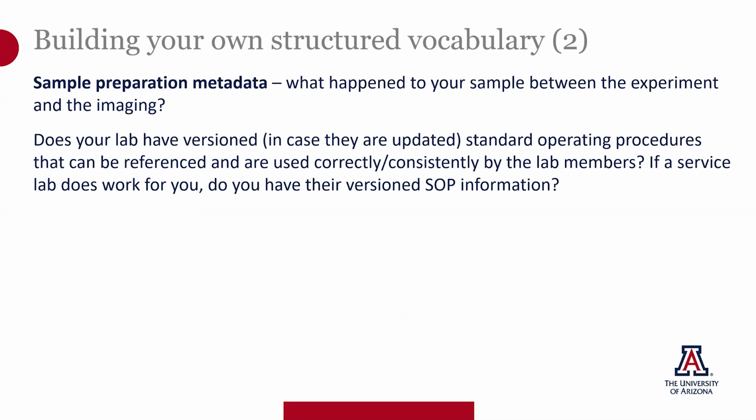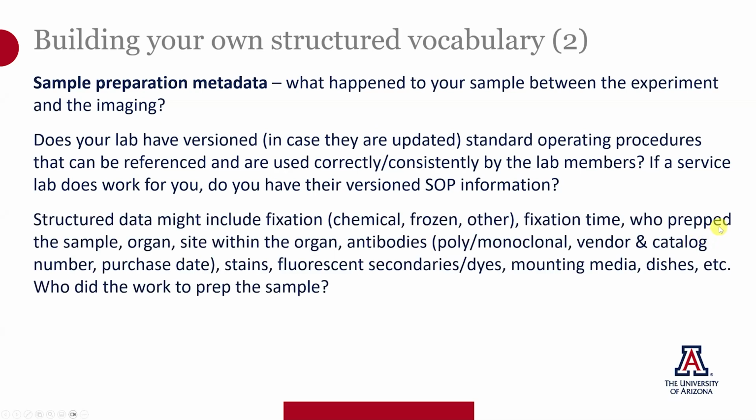The next question might be, what happened to your sample between the experiment and your imaging? Do you have standard operating procedures that can be referenced for your fixation, for your antibody staining? And if you used a service lab, do they have a versioned SOP that you can include? And you might include things about how the fixation was done as well as fixation time. Again, who prepped the sample?